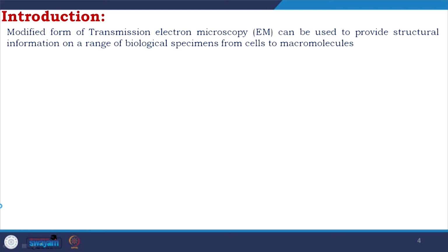This is very important when we are talking about X-ray crystallography. X-ray crystallography is specific for DNA, RNA, protein and viruses. NMR has many dimensions. It could be used to identify small molecules, it could be used to identify secondary structures. There are so many different types of experiments. It could even be employed for dynamics.